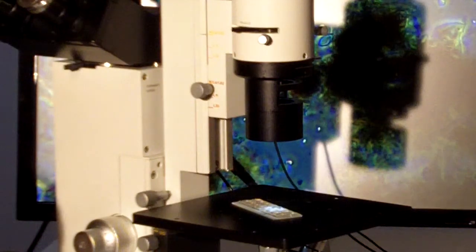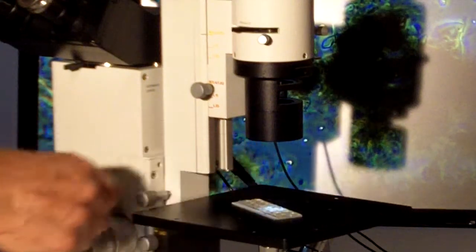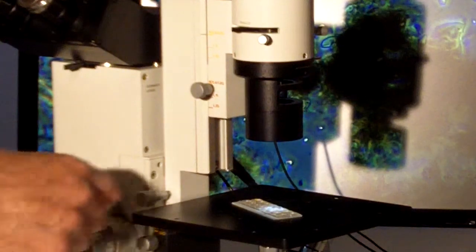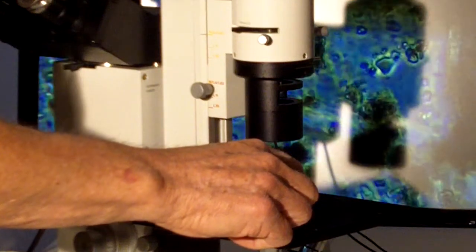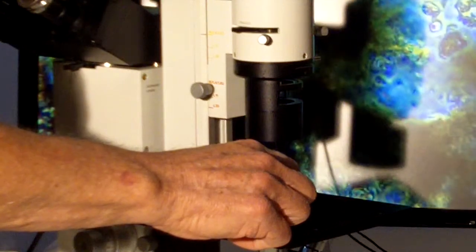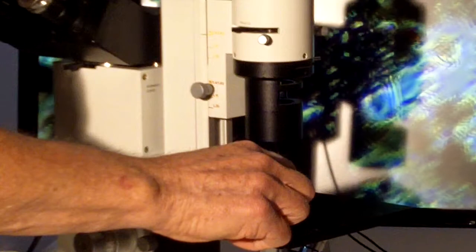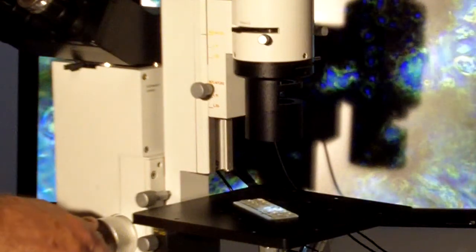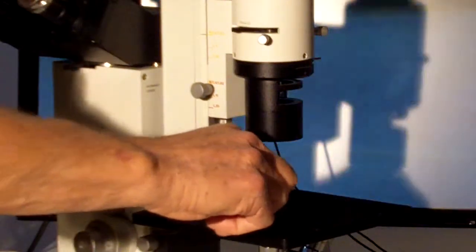Here you'll see a lot of little swimmers moving around in the sample dish. So that's what phase contrast is all about.